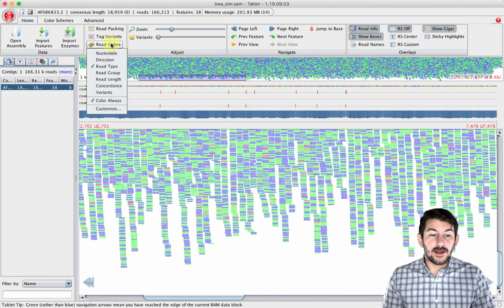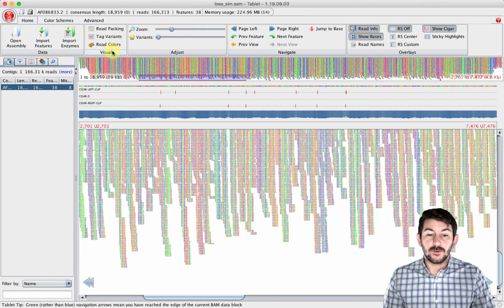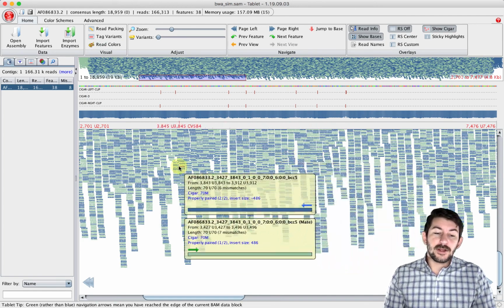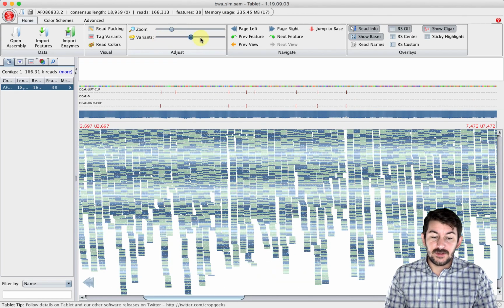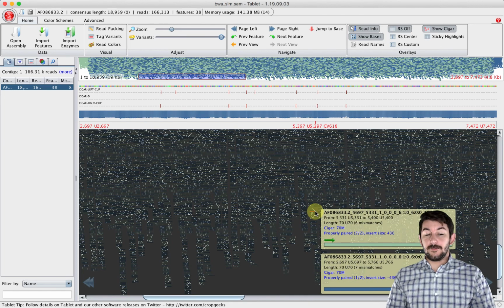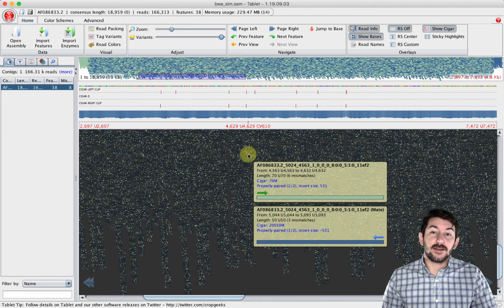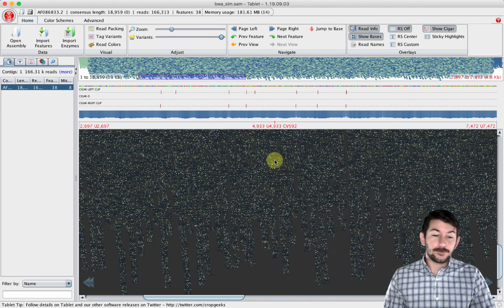And we can play around with the read color. We could look at the nucleotide sequence if we wanted to. We could do all sorts of stuff to play around with this. We could look at directionality of the reads. And so I would encourage you just to take a second and explore. You could even see where all the variants are. In other words, where are all the errors? And these are all lit up. You can see this is, again, very, very full of errors. So maybe also try visualizing the Ebola stuff that was real data as well and see how it compares.